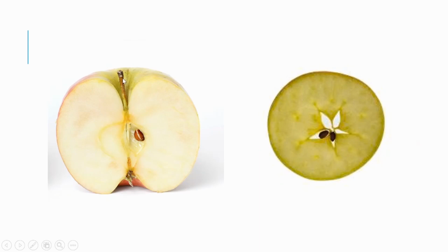So in the longitudinal section, we see the entire core from the stem all the way down to the bottom here. And when we take the cross section, we see the entire round part of the core, but we don't see the stem and we don't see the bottom. We're just getting a sliver in the middle. So if you think about yourself, longitudinal would be if you cut yourself from your head all the way down to your toes, whereas a cross section would be like if you took a slice right out of the middle.